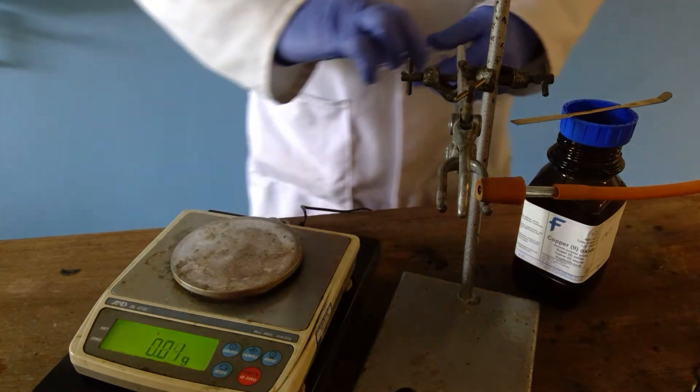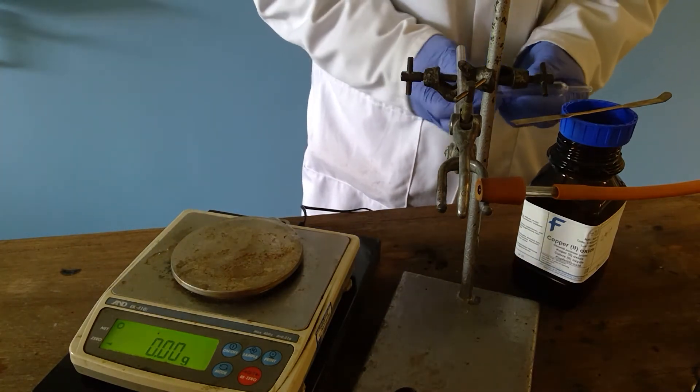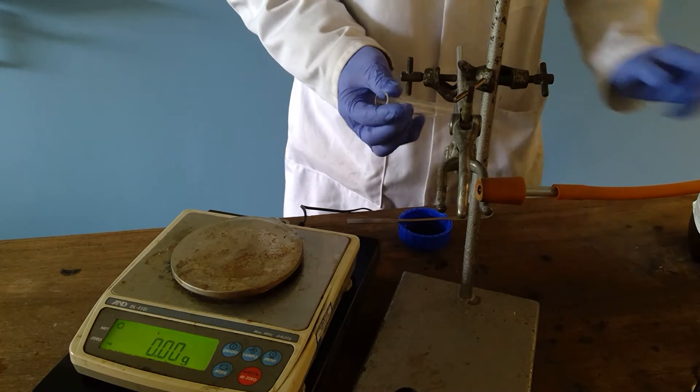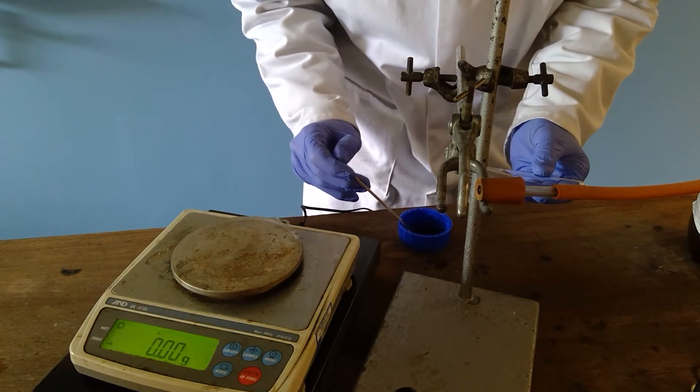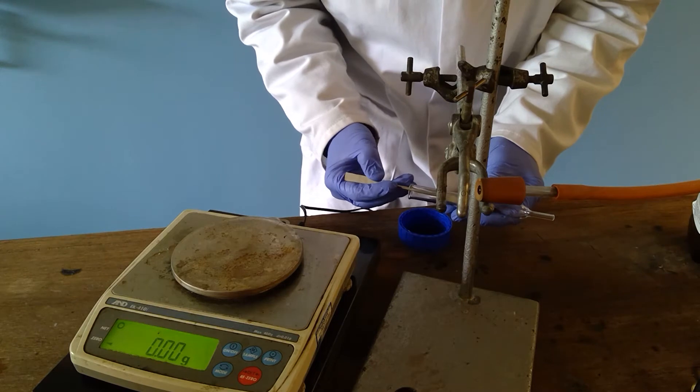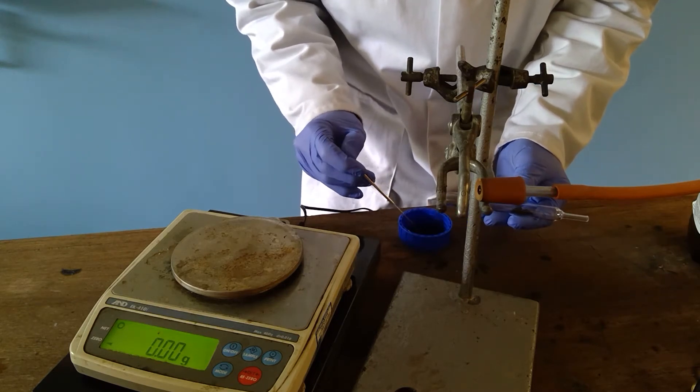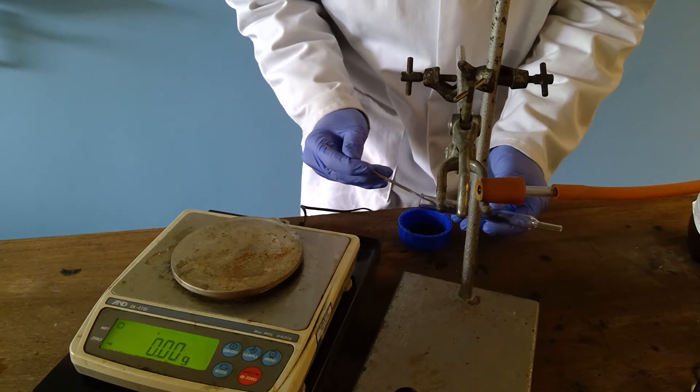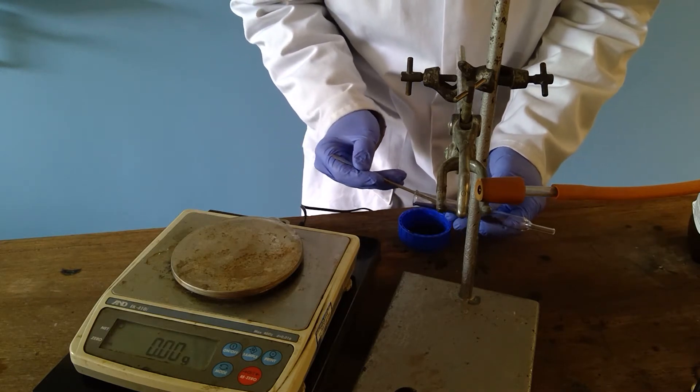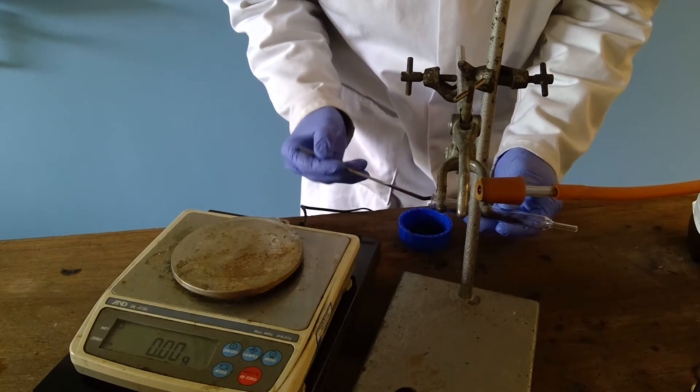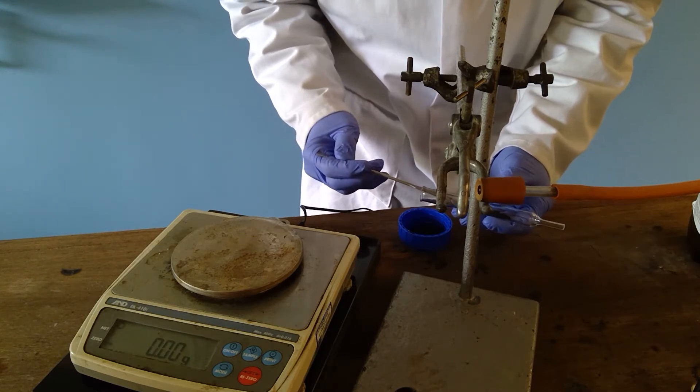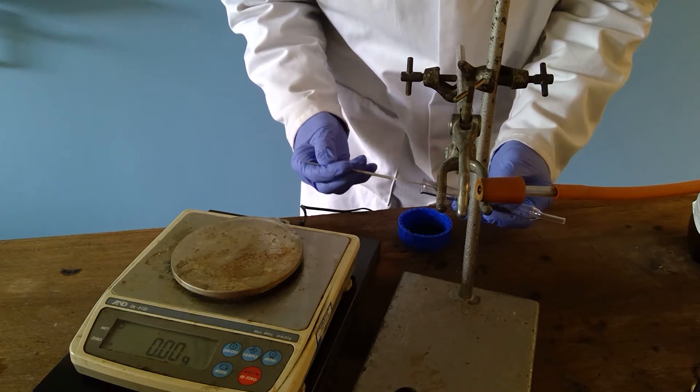I will then place some copper oxide into the combustion tube. The copper oxide here has just been poured into the lid to make it easier to transfer. I will try to put as much of the copper oxide into the middle of the tube so that we are able to heat it effectively, also making sure that not too much is near the bung, but still trying to spread it out as much as possible.